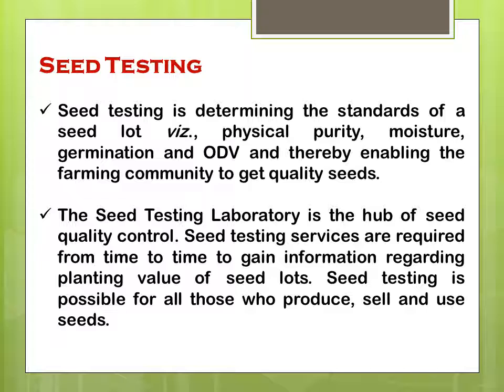Seed testing is determining the standards of a seed lot. You have to check physical purity, moisture, germination, and how to distinguish variety. Thereby we prescribe to the farming community how to get quality seeds. This seed testing laboratory is the hub of seed quality control, because only through the seed testing laboratory are you assured that your seeds are good.